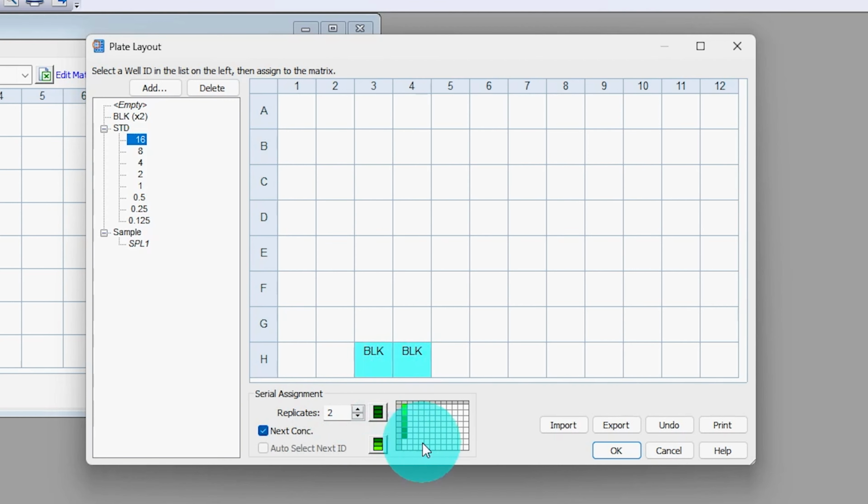And here it is very important to know how the option works. In the replicate, you can see it is showing that your standard replicates are in one column and arranged vertically, but this is not the case. So my standards are horizontally arranged in column 1 and column 2.